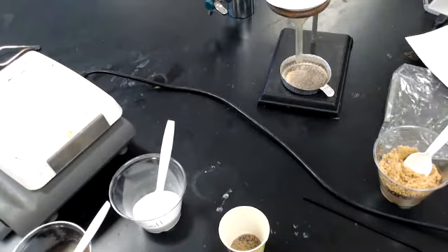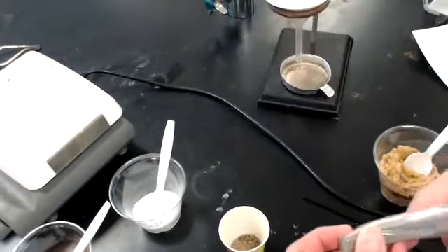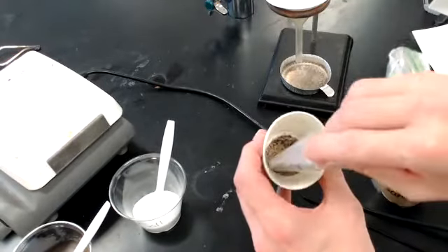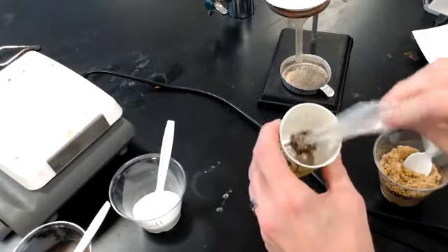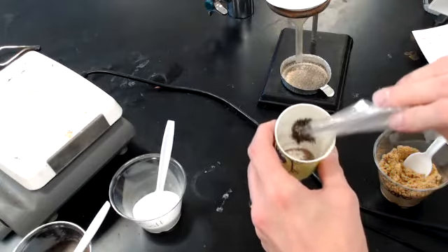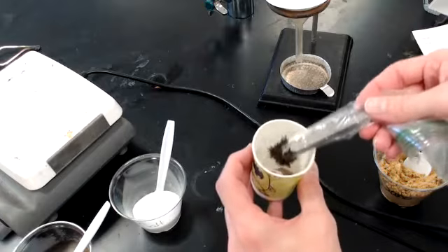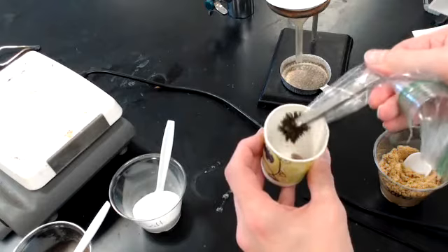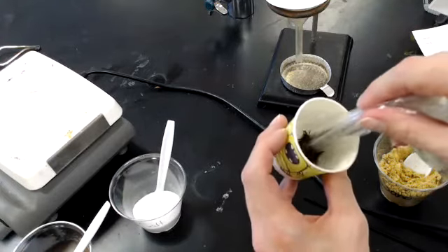The first thing I'm going to do is use a magnet. I have a magnet in a baggie, and you'll see why it's in the baggie. It's for convenience. So I'm going to take my mixture, and I'm going to put my magnet in, something like that. I'm trying to tap away the sand, which tends to get caught in between the iron. Check out the big wad of iron, right? Okay, I did use a lot of iron.